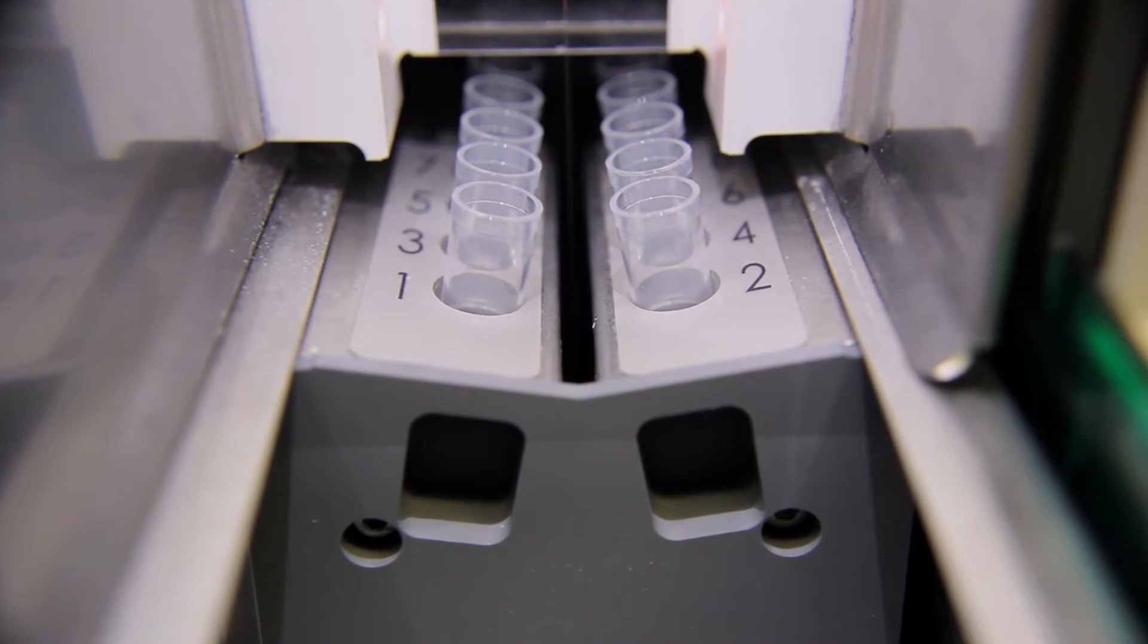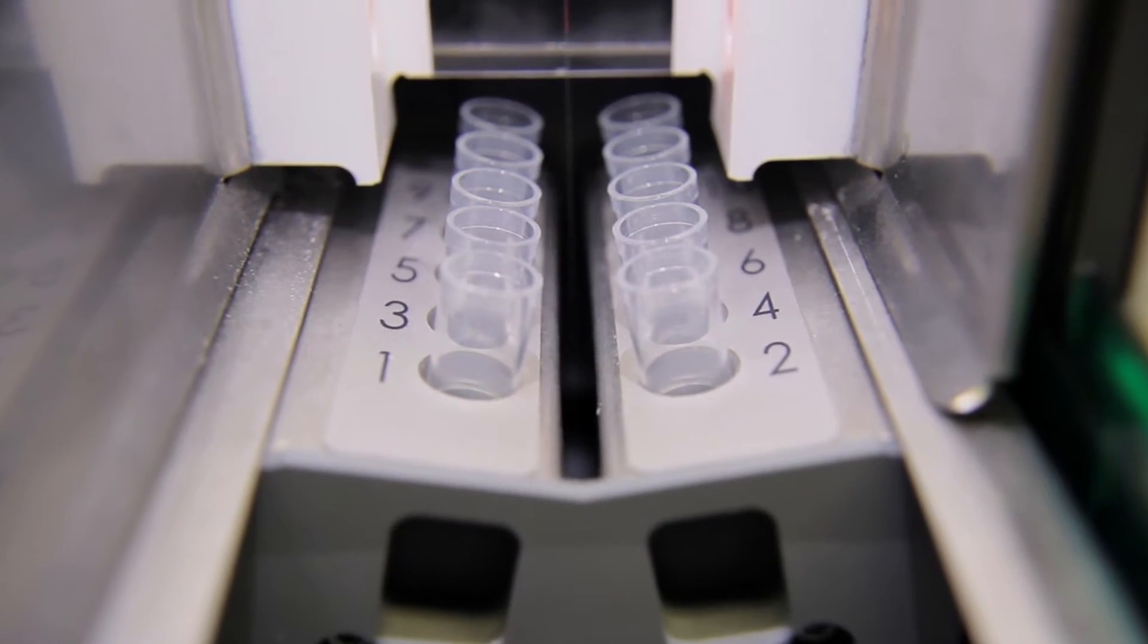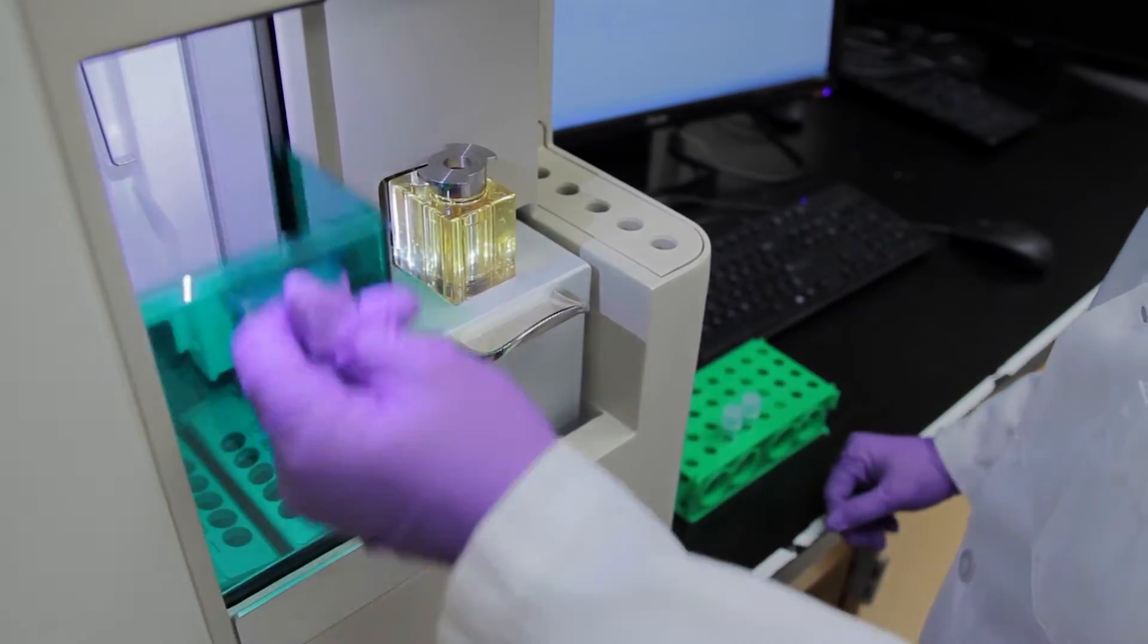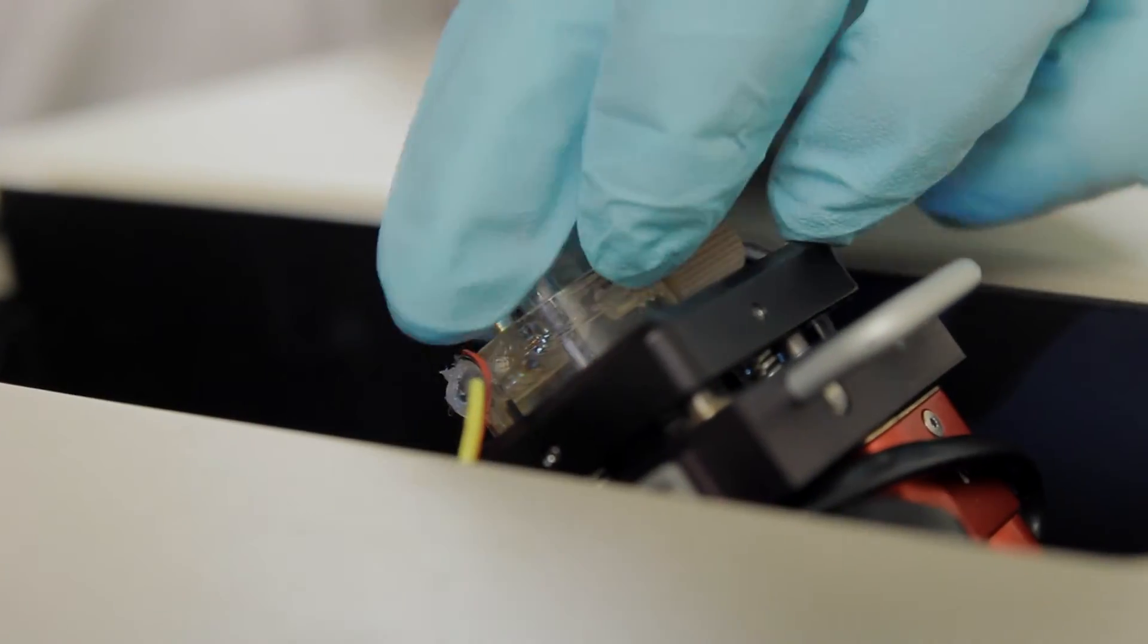Manual adjustments are now a thing of the past for jet in-air sorting. Start cell sorting more quickly with the Bio-Rad S3E Cell Sorter's Auto Gimbal System for nozzle tip alignment.